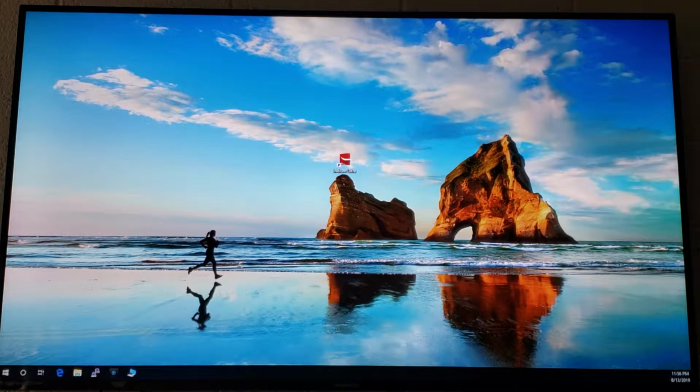So right now, my mouse is on this monitor, and if I run it to the right, it's on this monitor, which is the top monitor, right? And I have my IXRF program. When I extend it, the IXRF program normally just pops on this monitor. So I'm going to bring up my SEM again. My SEM is here on this monitor, and on this monitor will be my X-ray system. So we can start talking about EDS.